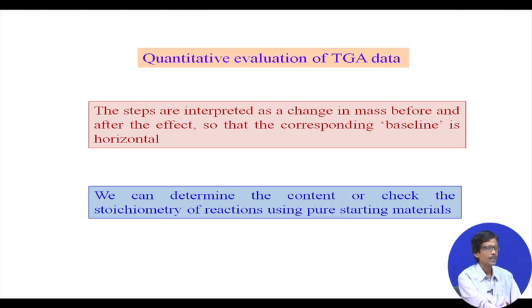We have certain percentages of calcium as well as certain percentages of magnesium present in it, but there are other extraneous components. It can be other bivalent metal ions, and those bivalent metal ions may or may not give the corresponding oxalates as insoluble precipitates. But if they do give oxalate precipitates, then your precipitate, which you expect to be calcium oxalate, is further contaminated with other bivalent metal ion oxalates.